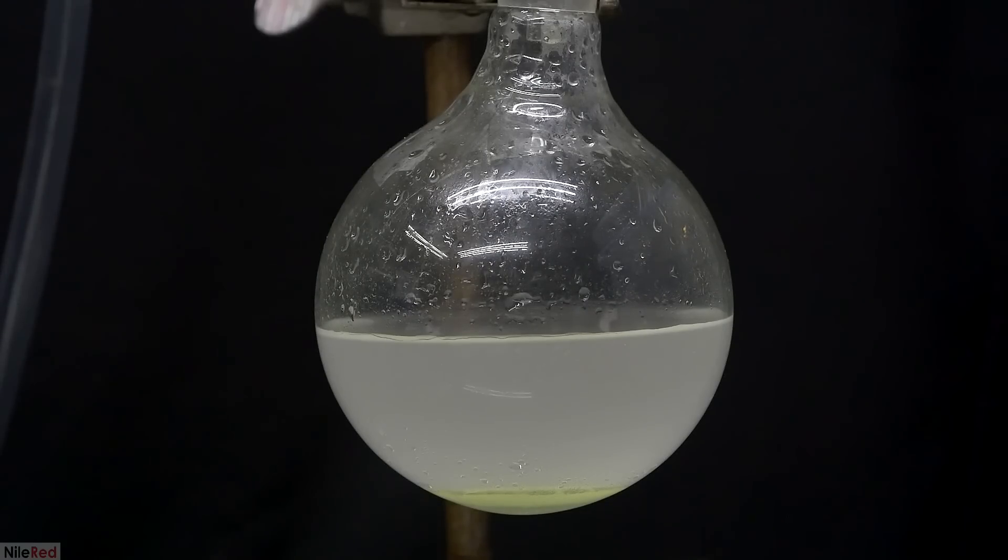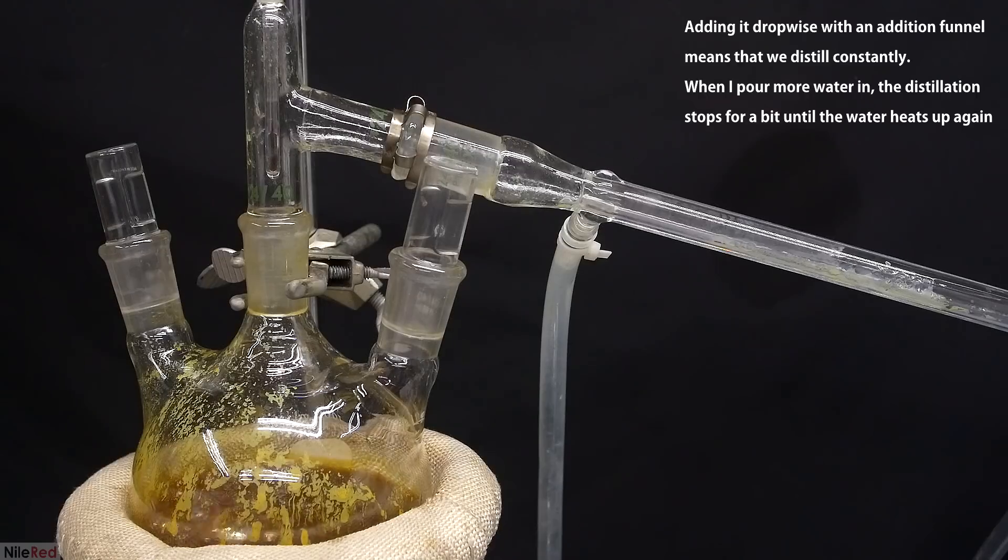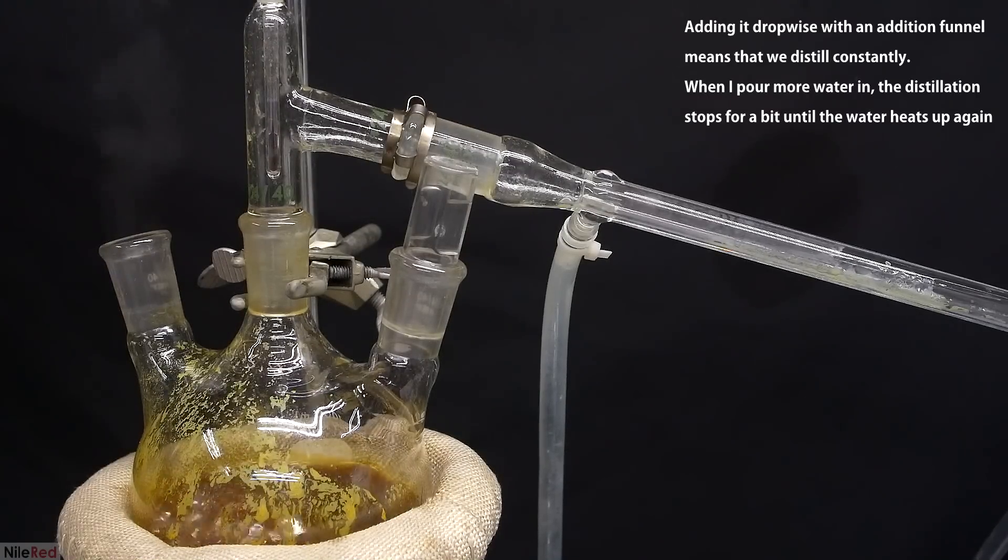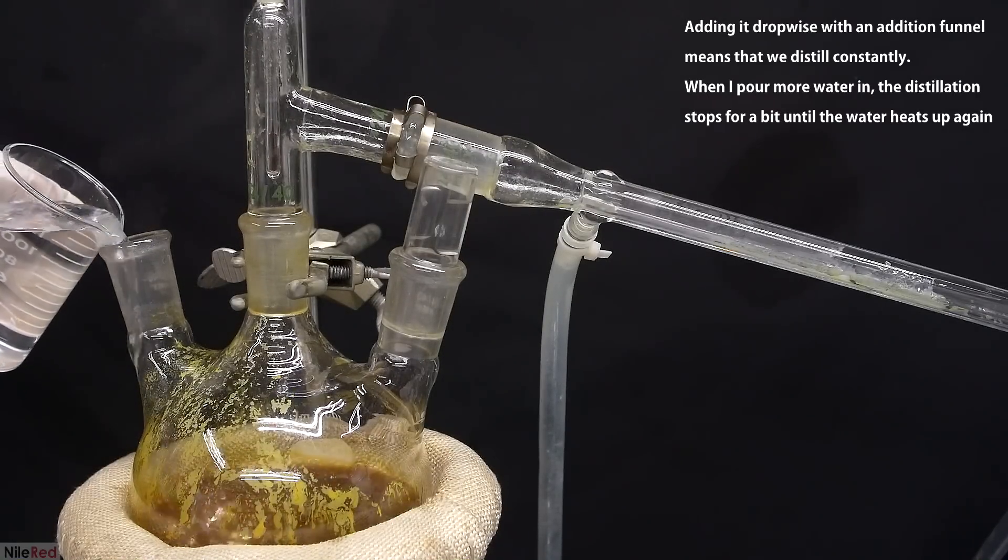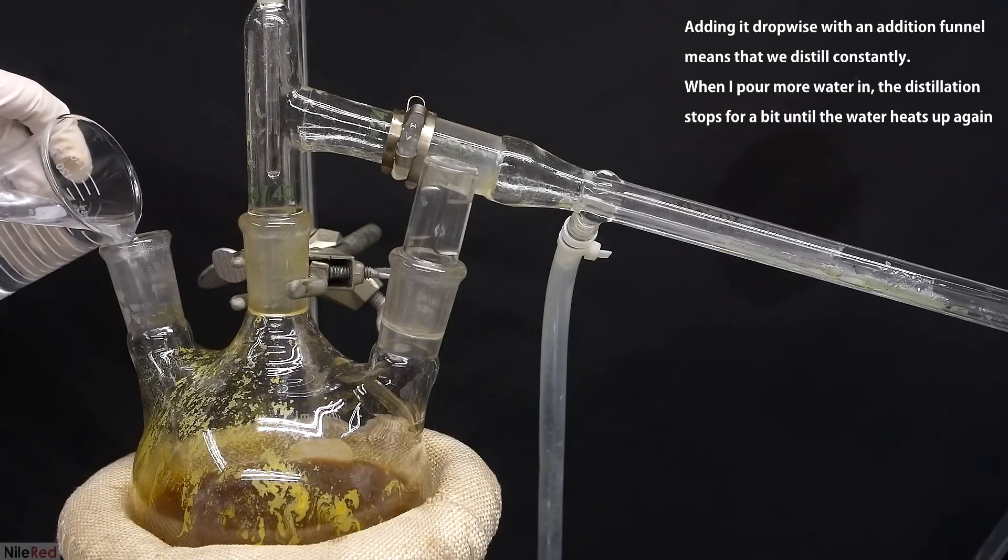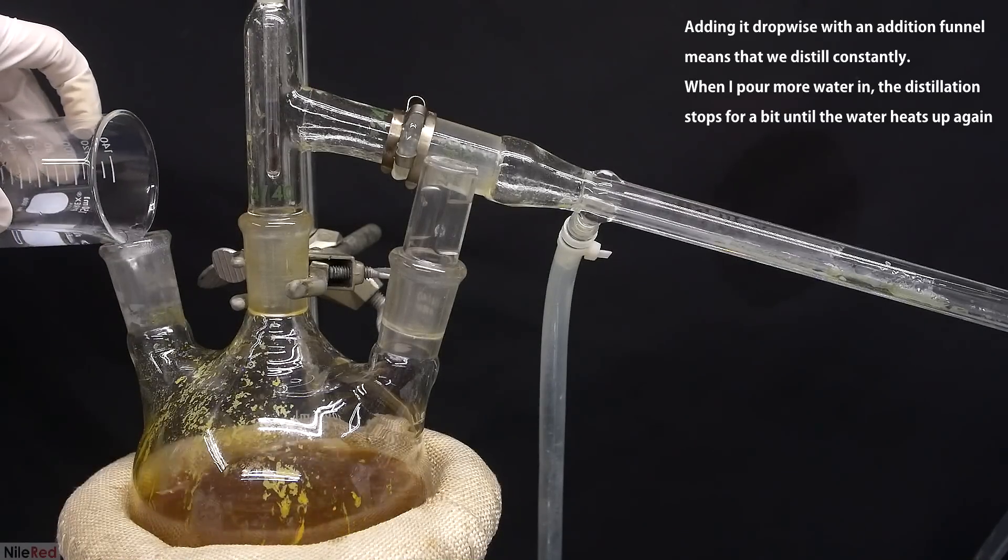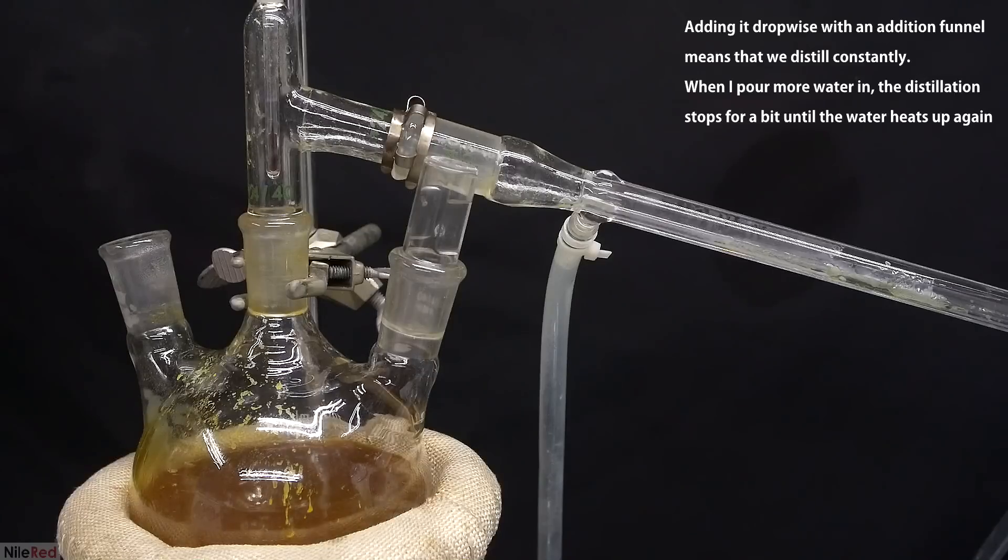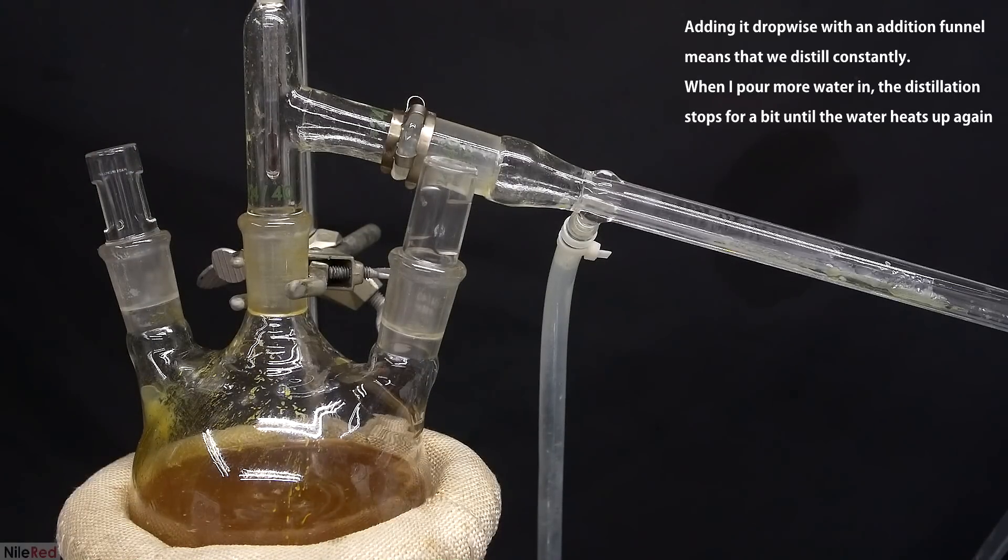After we've collected a little over 100 milliliters, I take a look at the receiving flask and we can see an oil layer at the bottom. As the distillation continues, we're going to have to occasionally replenish the water in the flask. I just poured in a large amount of hot water every so often, but the proper way is to slowly add it using an addition funnel.